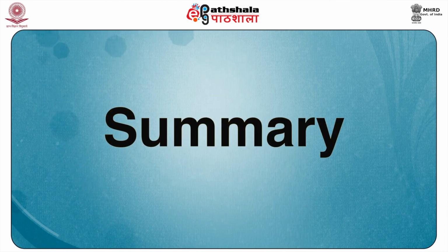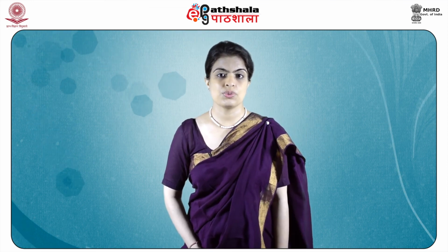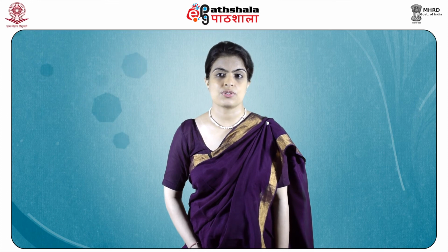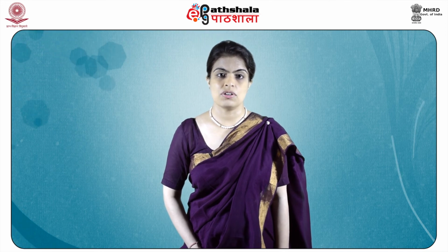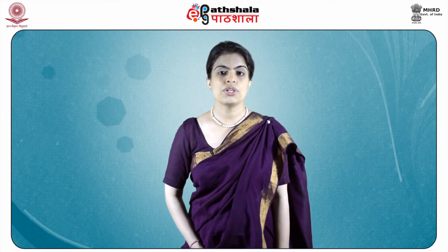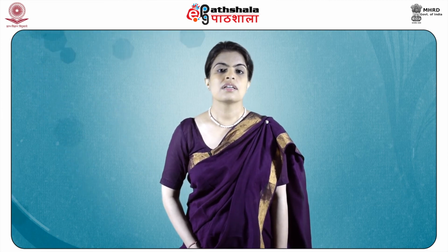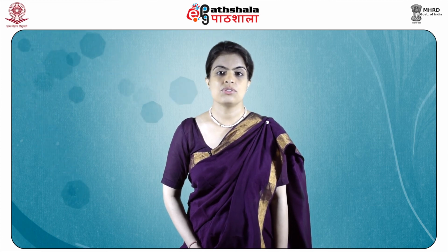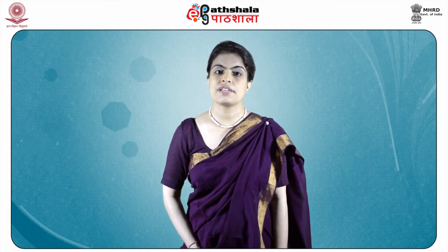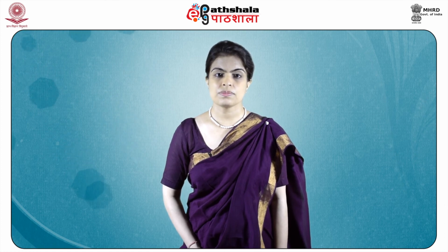Now we will summarize what we have learned so far. Ion exchange chromatography is used for separation of charged molecules from a complex mixture. Protein molecules are commonly separated on an ion exchange column. An ion exchange column consists of a solid resin to which charged groups are bound. The resin can be made of agarose, dextran, cellulose or copolymers of styrene divinylbenzene.